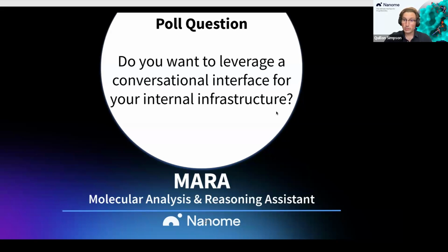But we'd also really like to hear how you think you'd benefit from having Mara and other software vendors integrated together. So by all means, if you wanted to reach out to us and discuss further, we'd love to jump on a call to show you some potential deployments and hear you out on where you think it would be a value proposition to have functionality built out.